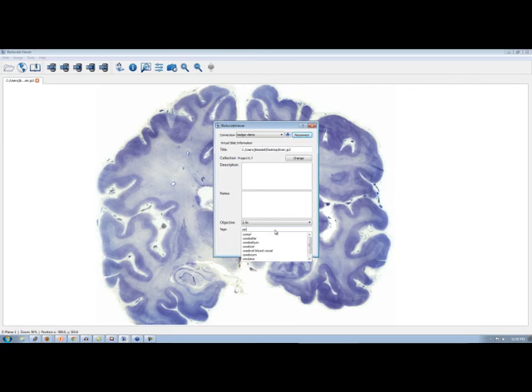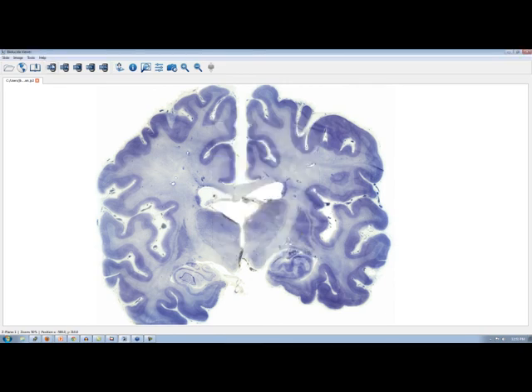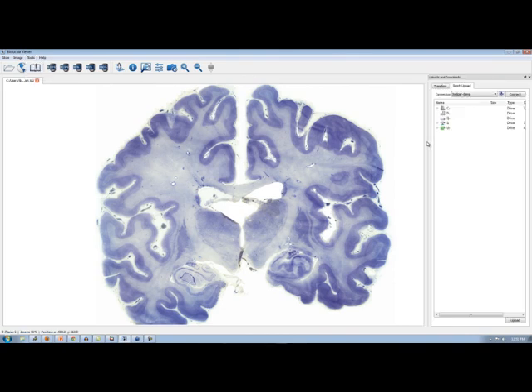So Jeff, what you had shown us previously was that you can edit this kind of information on images once they've already been uploaded to the Biolucida server. But what you're showing us now is that you can actually tag and categorize things as they get uploaded. Yeah, exactly. By doing this, you're going to upload this image with all the information that it has. But this is just for one image. Let's say, for example, you had a number of images and you wanted to do them all at once. We also have a feature up in Tools, which I just want to show you, which is called Uploads and Downloads. And let's see if I can widen this.